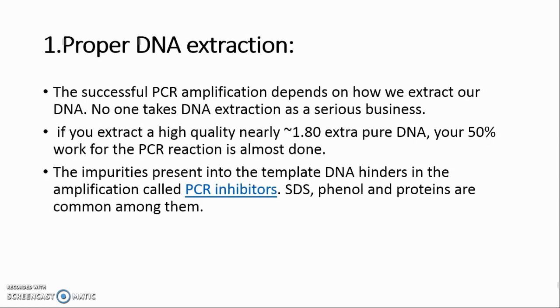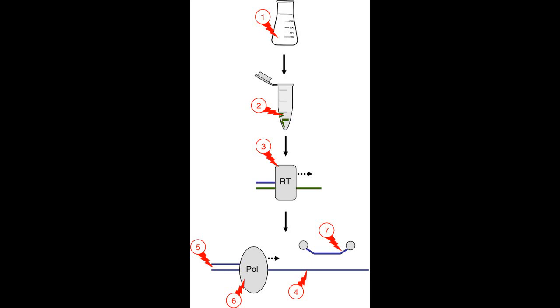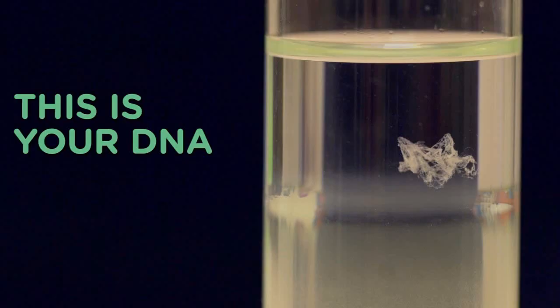Secret 1: Proper DNA Extraction. The mantra for successful PCR amplification depends on how we extract our DNA. No one takes DNA extraction as a serious business, but if you extract high-quality, nearly 1.80 A260/A280 pure DNA, your 50% work for the PCR reaction is almost done. The impurities present in the template DNA hinder amplification — these are called PCR inhibitors. SDS, phenol, and proteins are common among them. No matter how perfectly you optimize your reaction, if your DNA is not properly extracted, your PCR's future will be in danger.